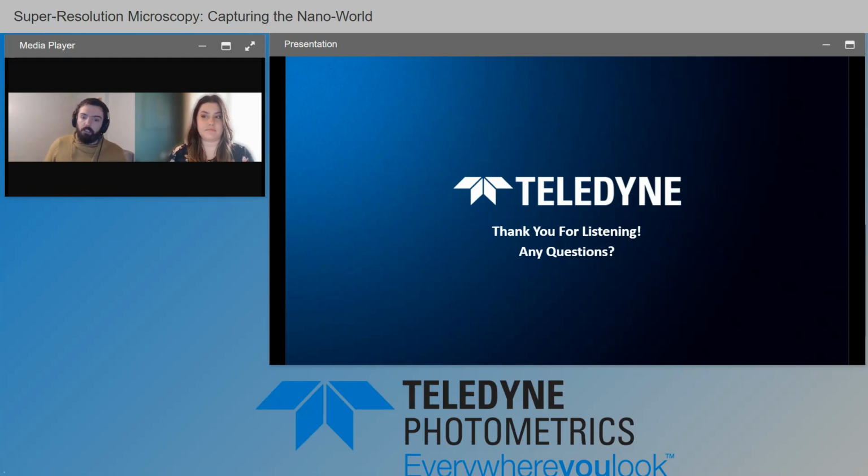It will give you a higher resolution, but is the image you're getting biologically relevant? So you're definitely right that electron microscopy will give you a similar result, if not much, much higher resolution, but it's also quite a lot harsher to the sample and a lot more inaccessible to some groups. If you have the ability to use it, it definitely gives you a highly, highly magnified image at a very high quality. But maybe this isn't suitable for some groups that are using live samples, for example.